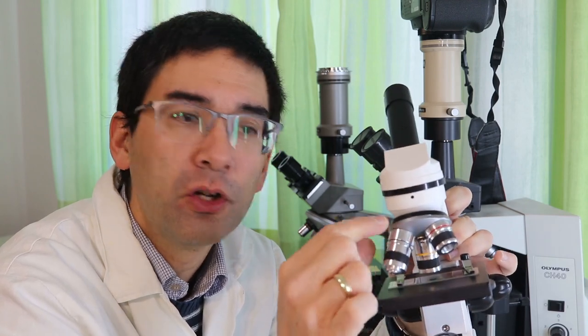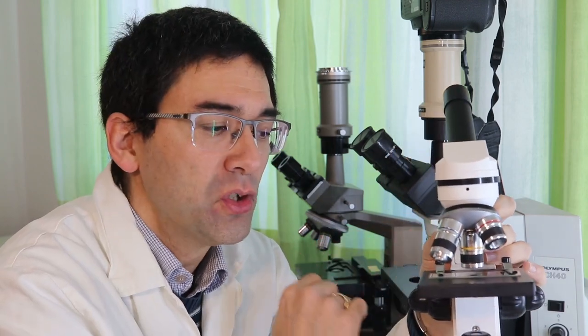Another thing is it has mostly a metal construction, and it also has relatively large objectives. So these were the criteria that helped me distinguish this microscope from other microscopes that are more into the toy microscopes.